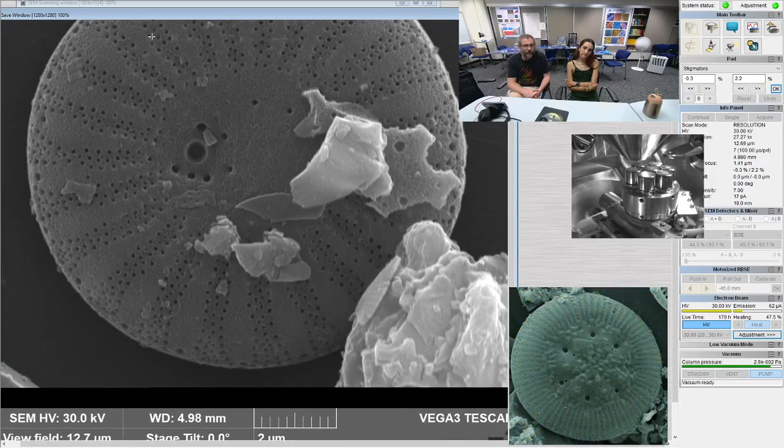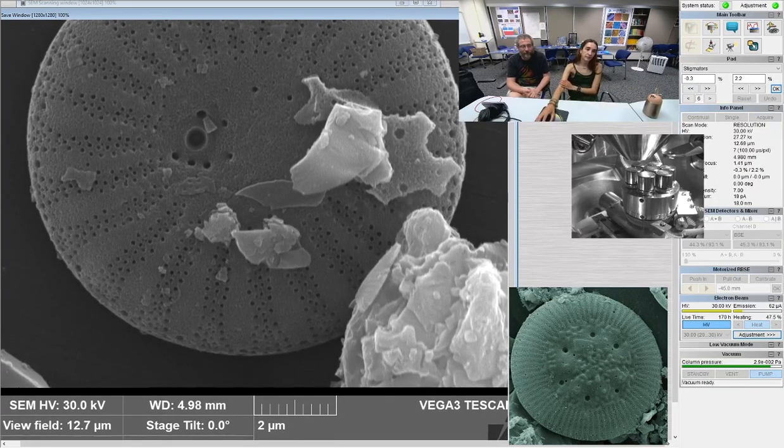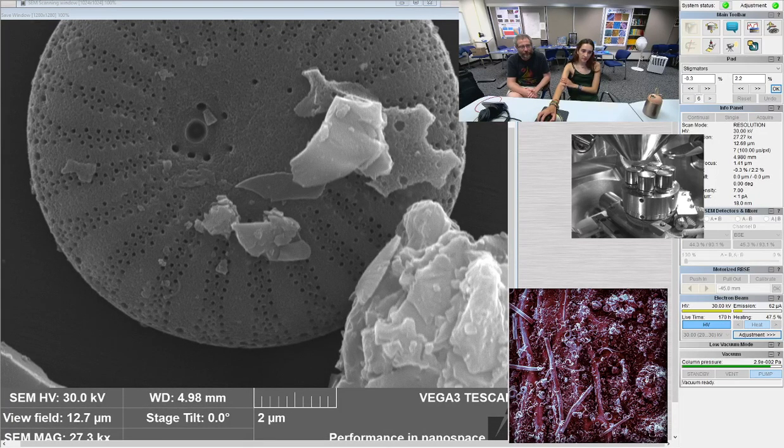So this is the same diatom we've been imaging all day. A small version of the same cyclotelloid. When they get a little bit larger, they tend to be a little more eyeball shaped, but it's basically the same diatom, I think.